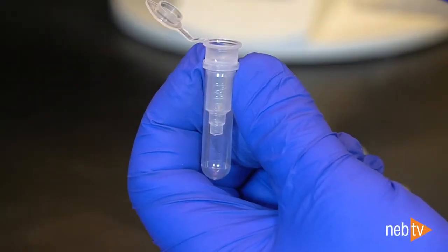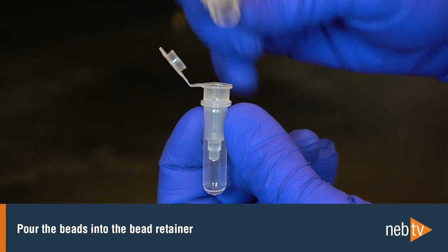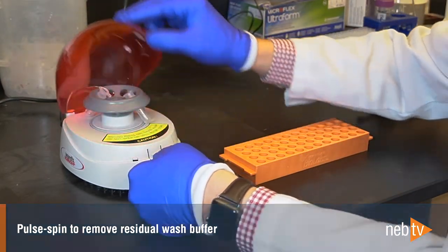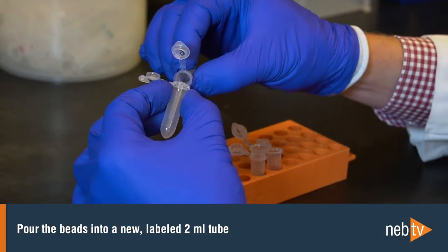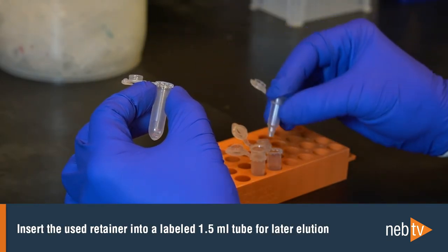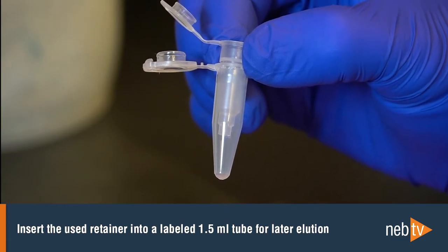Make sure the bead retainer is inserted into a collection tube and pour the beads into the bead retainer. Discard the used 2 mL tube. A quick pulse spin removes residual wash buffer efficiently, and there is no drying step necessary. Separate the bead retainer from the collection tube, discard the collection tube, and pour the beads into a new labeled 2 mL tube. Insert the used bead retainer into a labeled low-bind 1.5 mL microfuge tube — this will be used later for elution.